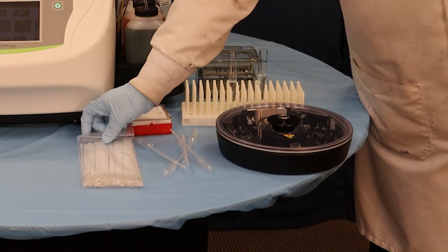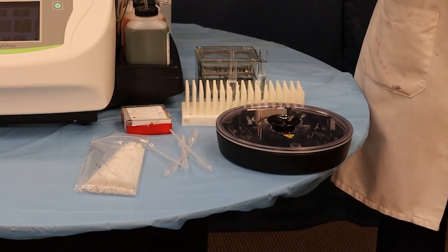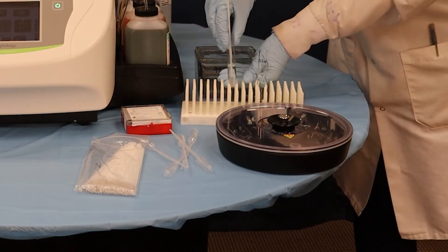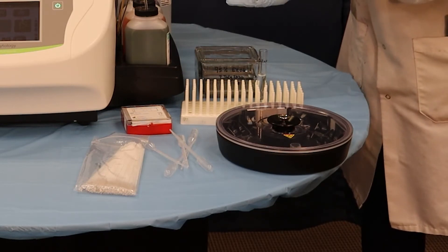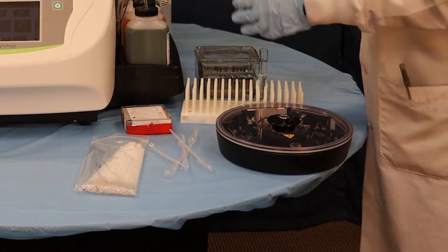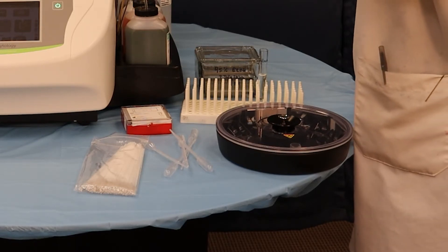We're going to start by using the brush to swab inside of our cheeks. Once you have a good swab, you'll be putting it into this tube and agitating it slightly. While that's sitting and the cells come out, we're going to label this — just a date and initials.